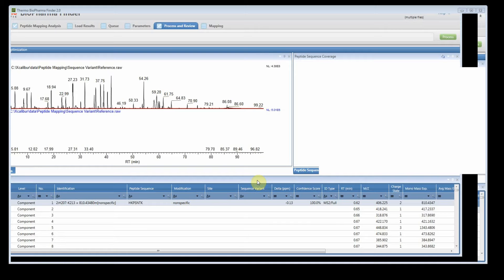Hi, welcome to the Biopharma Finder 2.0 help video. In this video I'm going to show you some of the new features in the peptide mapping workflow.